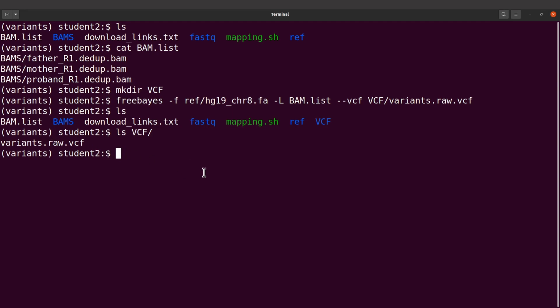So with the processing, you can remove low quality variants, so SNPs and indels. You can also decide to subset, maybe get variants for a particular sample, or you may want to also get variants for a particular chromosome, or you can also filter based on quality and so on. So there are a number of things you can do here. Those things, I've covered some of them already, and I'll also cover some of them later on. But for now, you just have to learn how to call variants. So after calling the variants, you can use tools like VCFtools, etc., to process the VCF further.